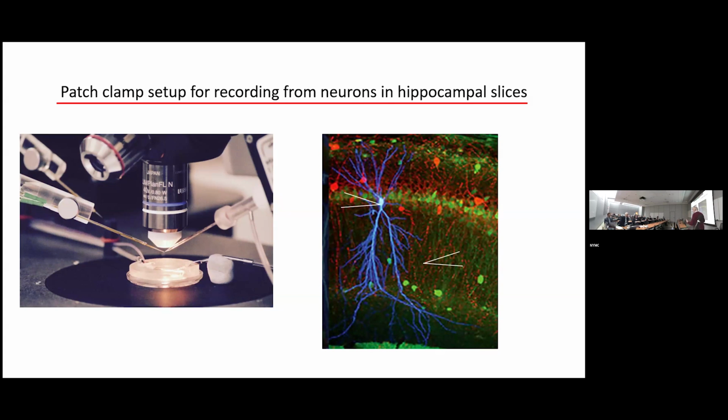But also, since they're indicators, they're going to tell us something about how the sodium and calcium change when the cell is stimulated. Okay. So this is a hippocampal slice. These are the cell bodies. And here's the patch electrode on the soma. In addition to putting dyes into the cell, this electrode can record the potential in the cell and can also stimulate the cell to fire, among other things, can stimulate an action potential.